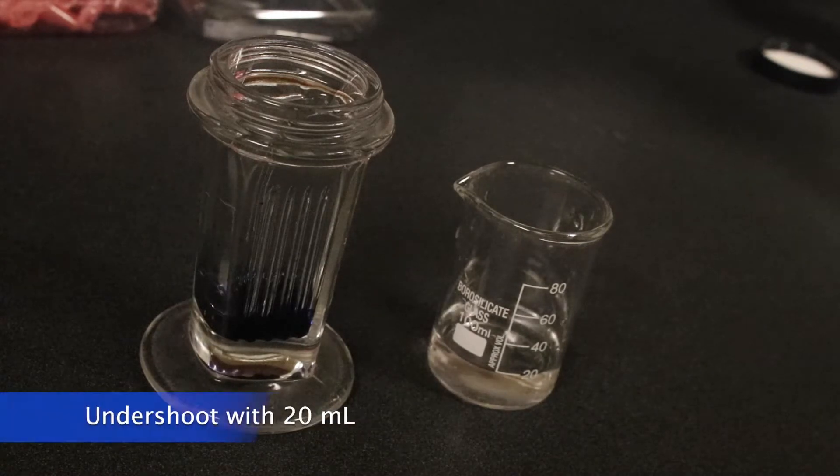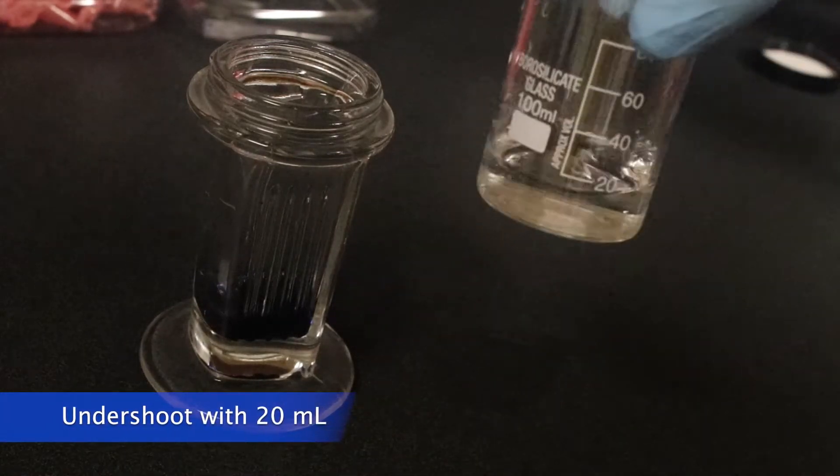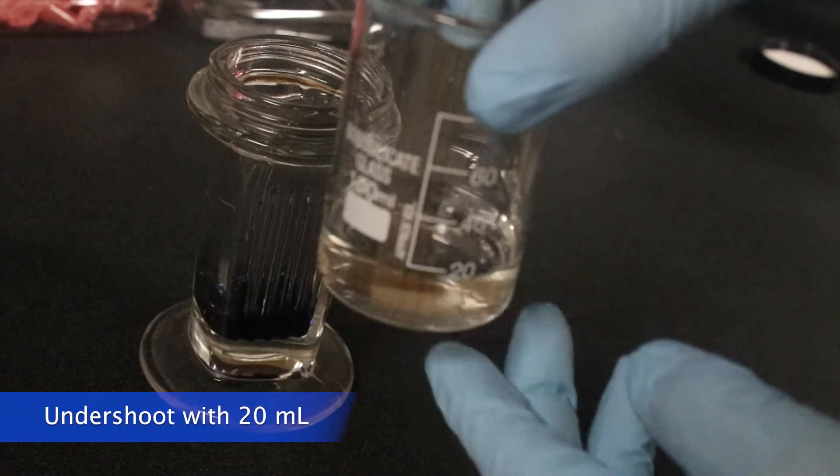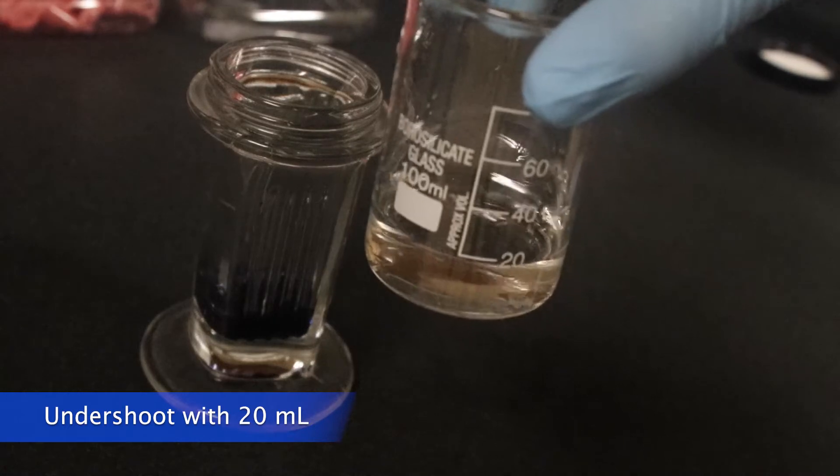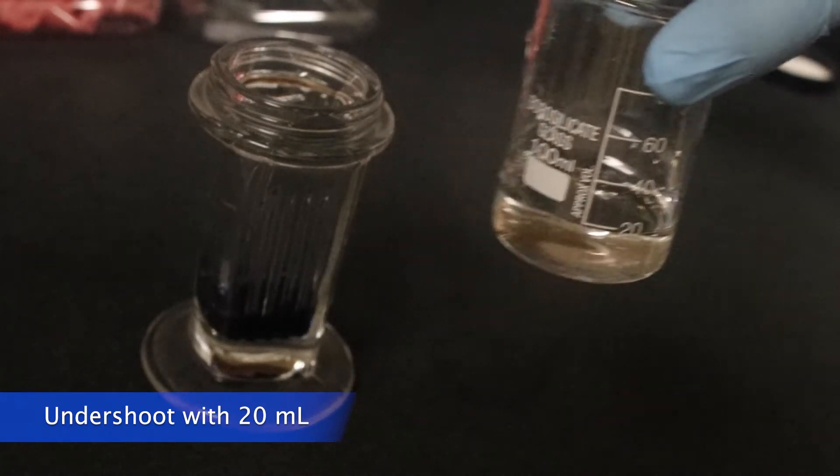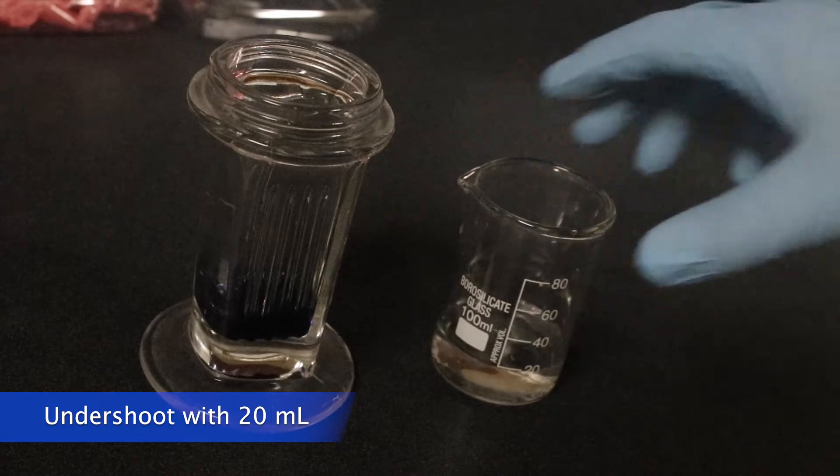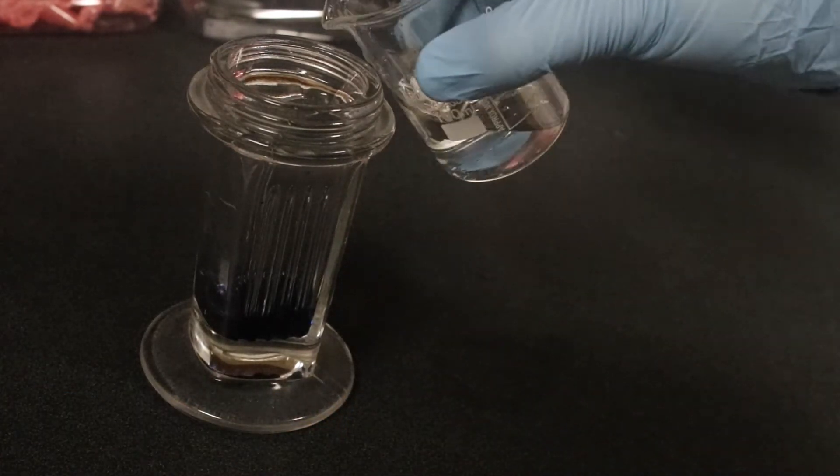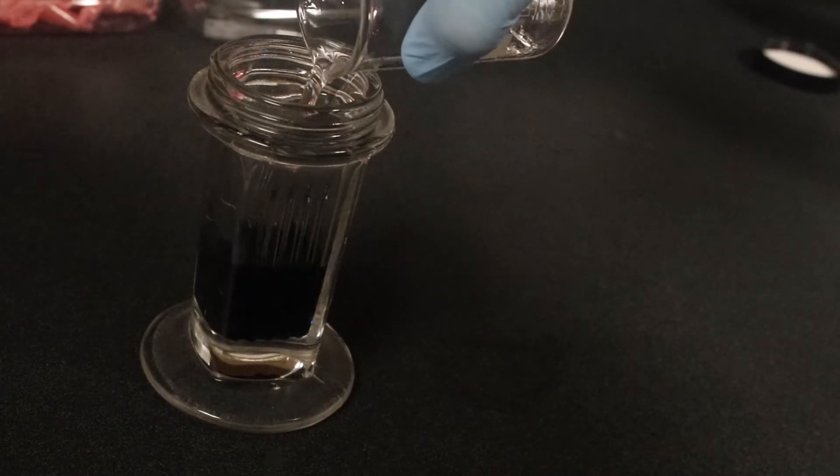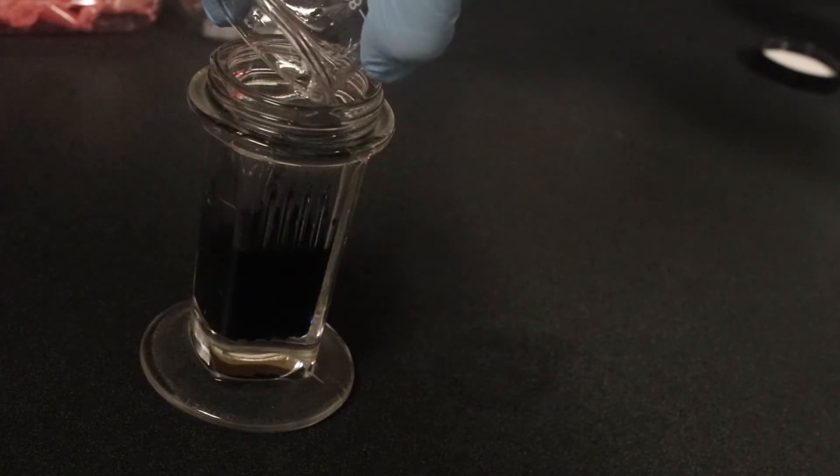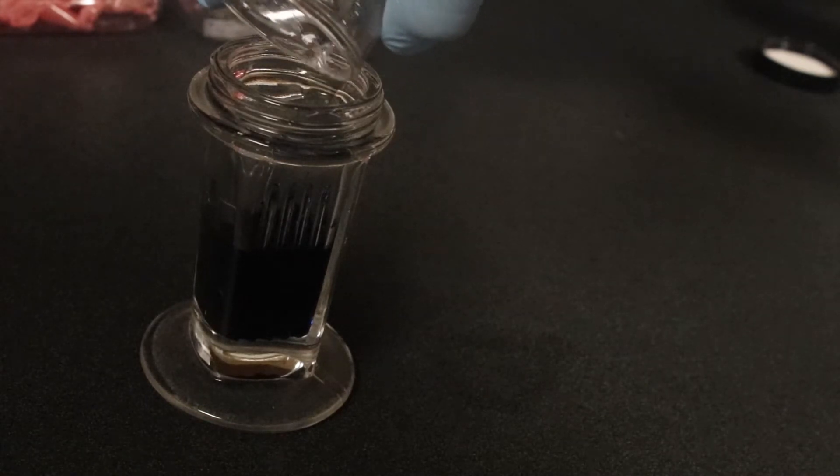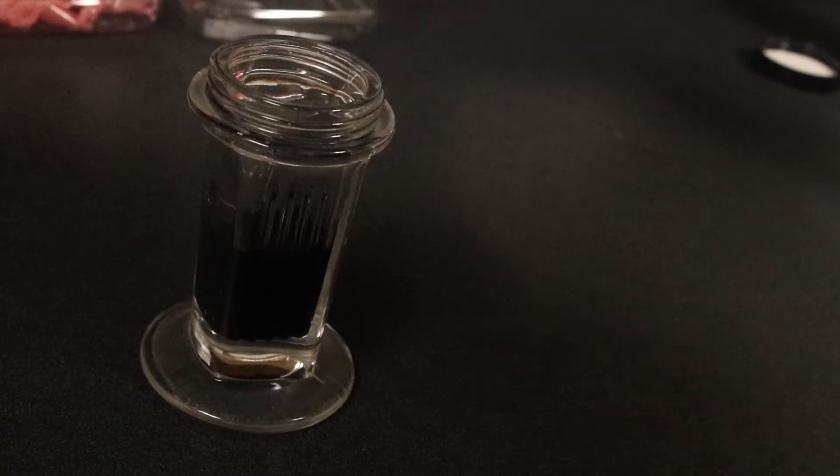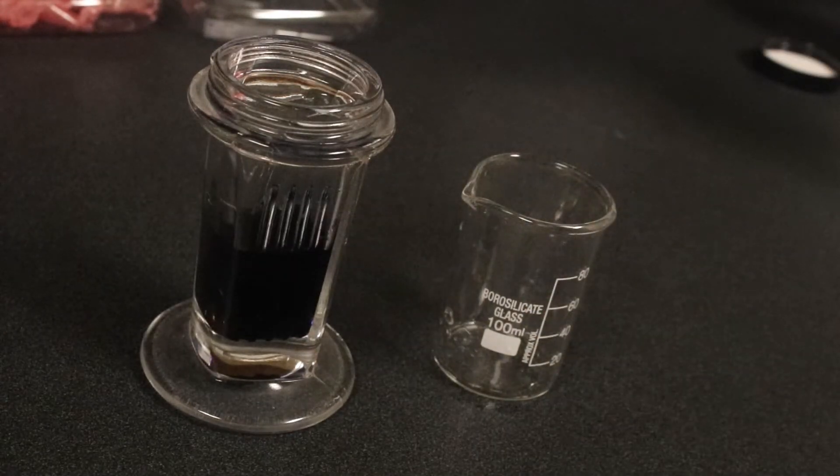Now, it's better here to undershoot the volume, because you can always just add more buffer in later once you put the slides into the Coplin jar. And this is important because the slides are going to displace water, so if you put too much, then you're going to get stain on where the numbers go on the slide, and you don't want that. So, I put 20 milliliters here, and then in the next step, I'm going to add five more milliliters after I put the slides in, just to be safe.